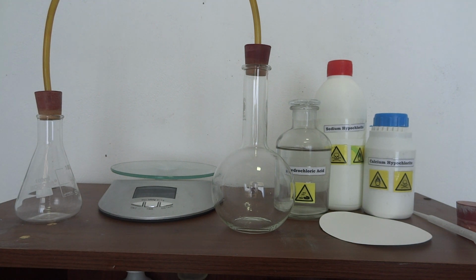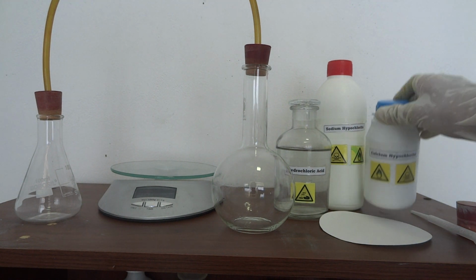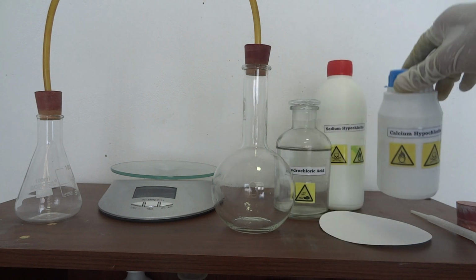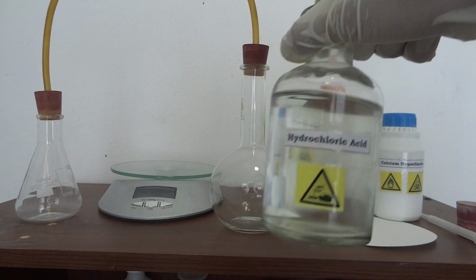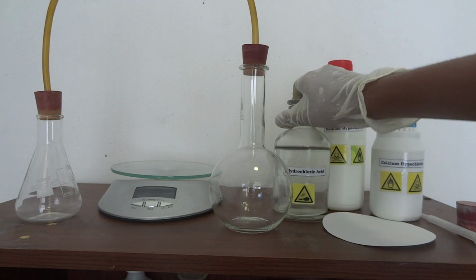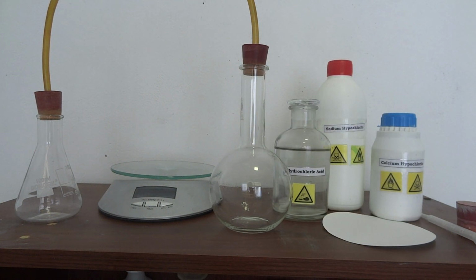So all this is to tell that elemental chlorine is really dangerous, it's poisonous. So when working with chlorine, you should definitely wear a respirator because it is poisonous, as I told you earlier. And we are making it by using calcium hypochlorite, which is also dangerous, and hydrochloric acid, which is a strong mineral acid that can burn your skin. So you should wear gloves when dealing with acid.